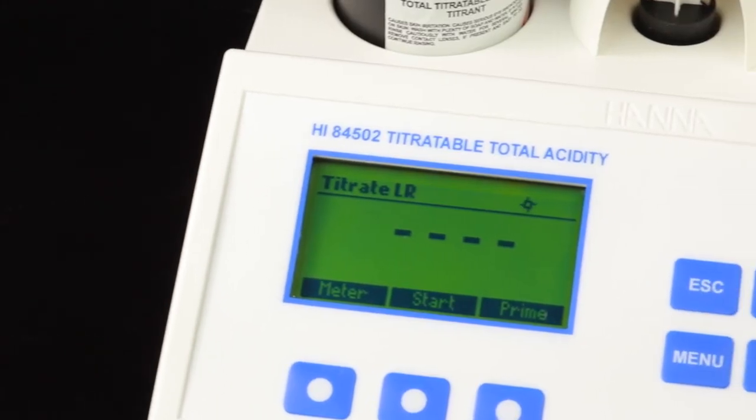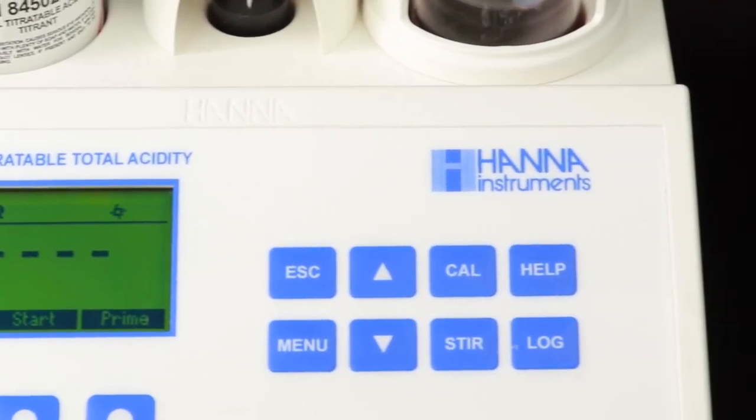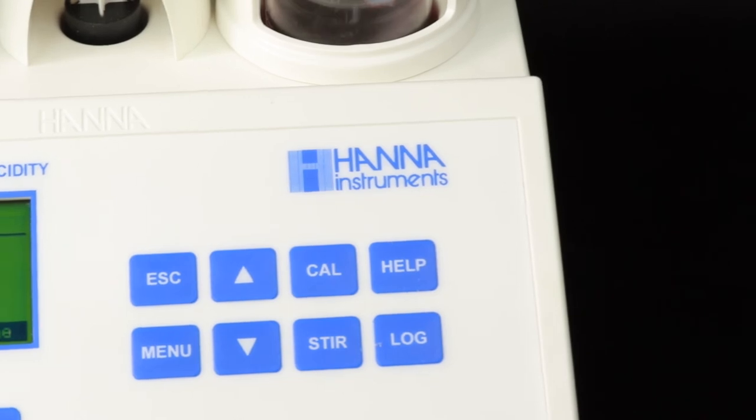Unlike sending your samples out to a lab where the cost can be upwards of $40 per test, the HI84502 allows you to obtain lab quality results at around $2 per test in minutes. This unit is perfect for wineries of any size and can consistently improve the quality of your wine.